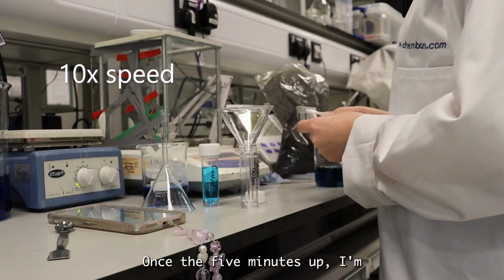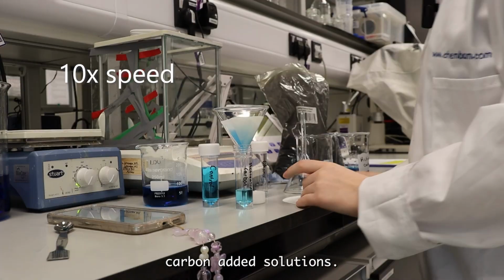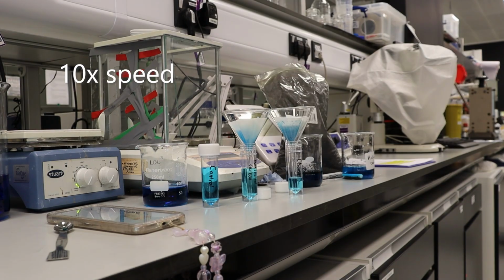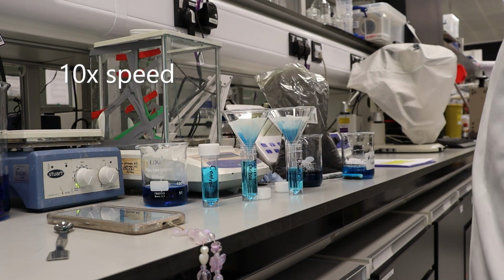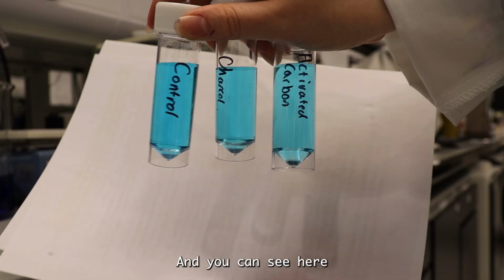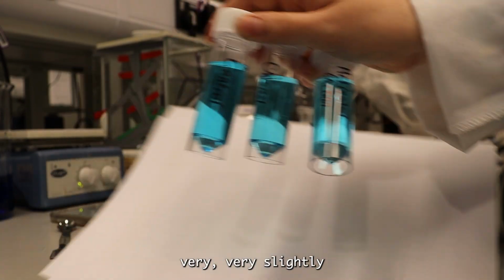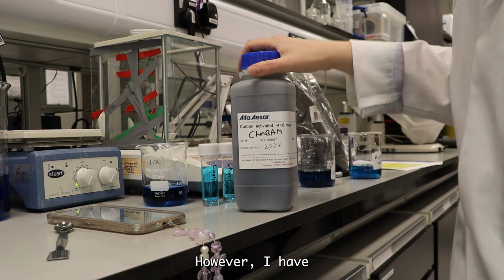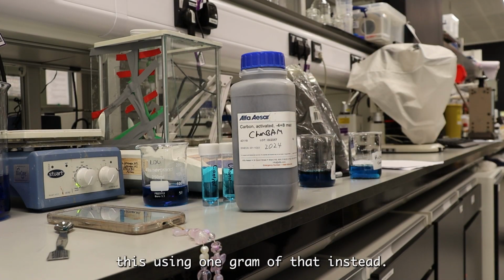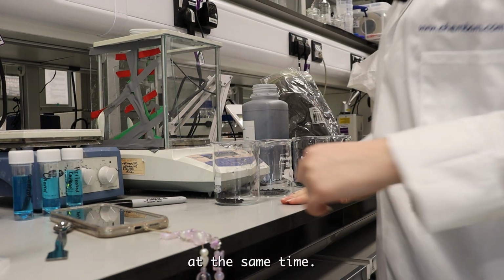Once the 5 minutes is up, I'm going to do exactly the same thing for the charcoal added and activated carbon added solutions. And you can see here that the charcoal and activated carbon solutions are very slightly lighter in colour than the control solution. However, I have another brand of activated carbon, so I'm going to retry this using 1 gram of that instead. This is currently stirring, however I'm going to set up another experiment at the same time.